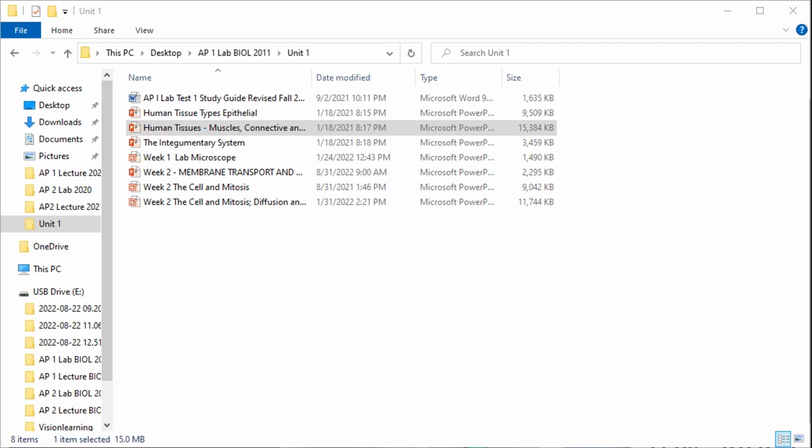We saw water went into the cell with the salt water inside of it, because there was lower water inside the cell and higher water outside the cell. Water came in. We saw a weight gain. So it worked. The other one, not so much.